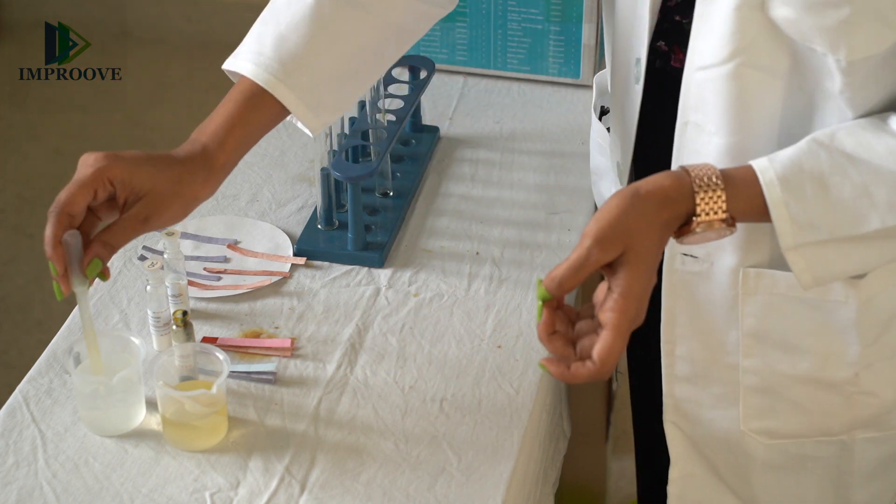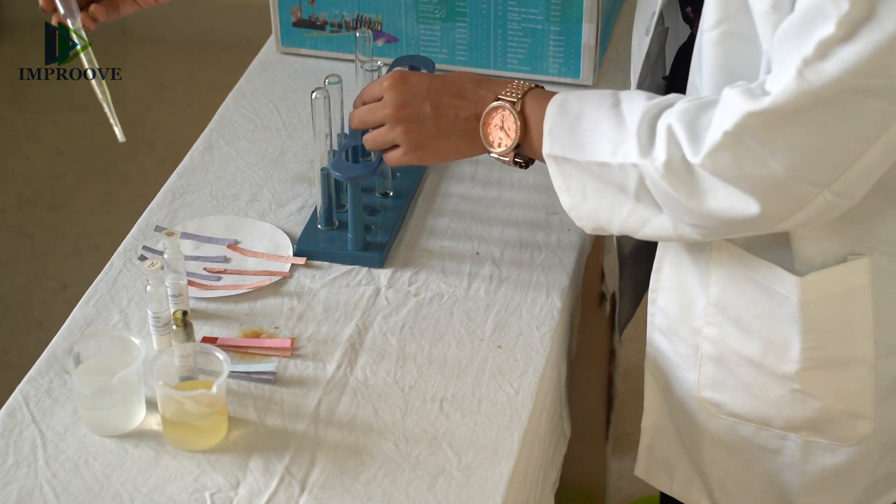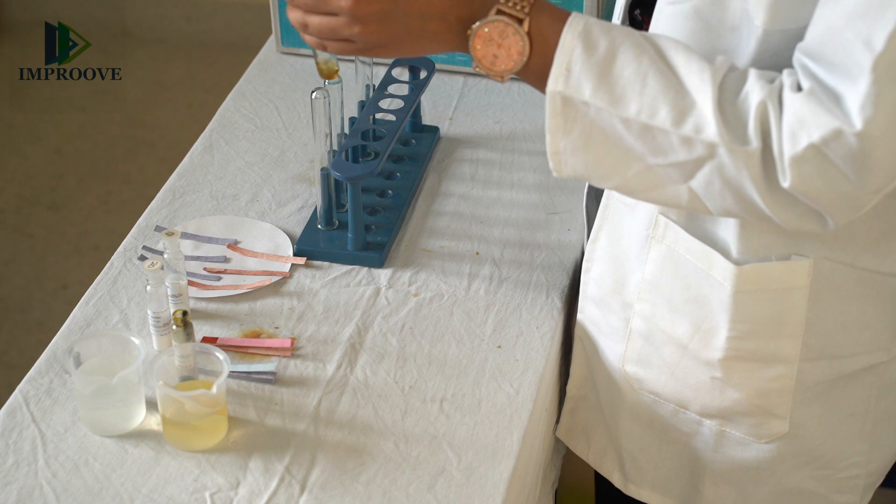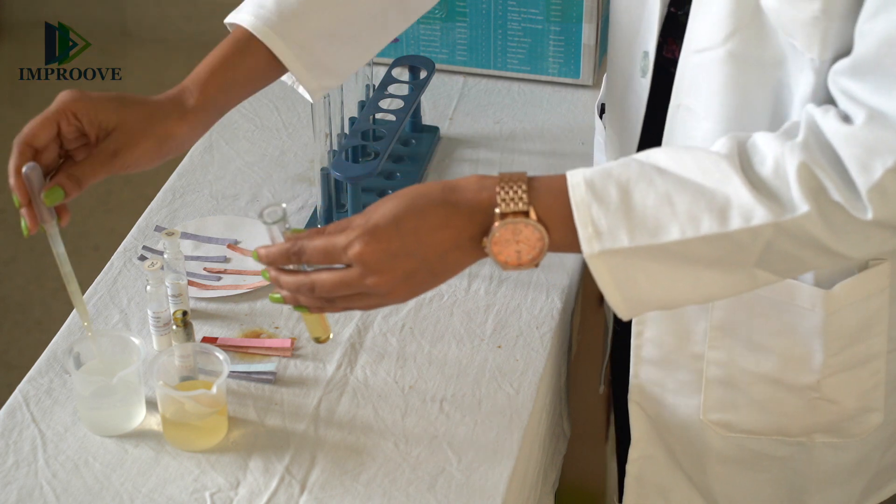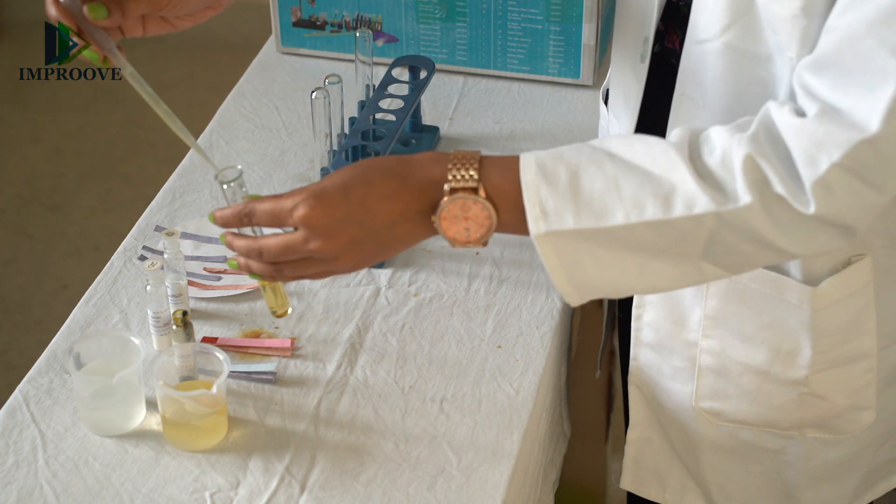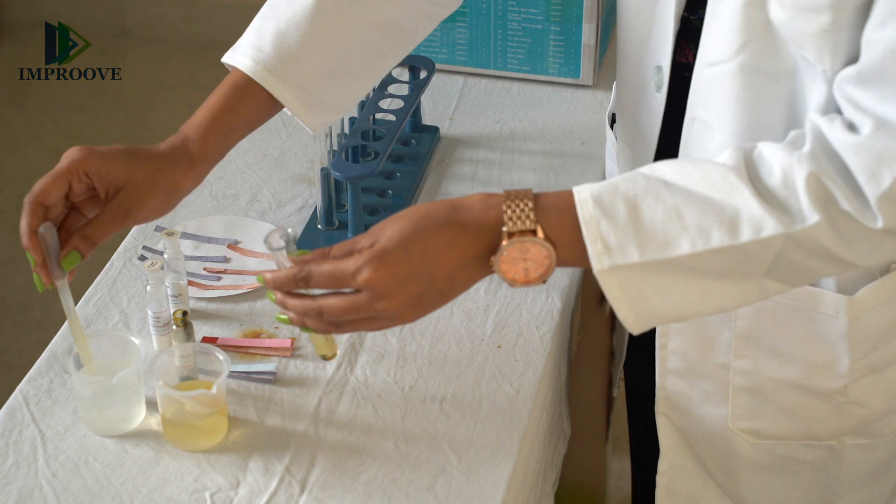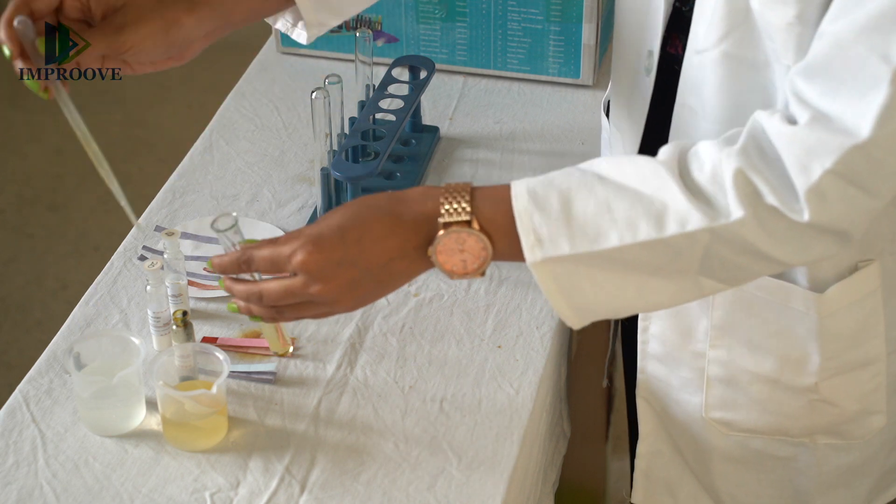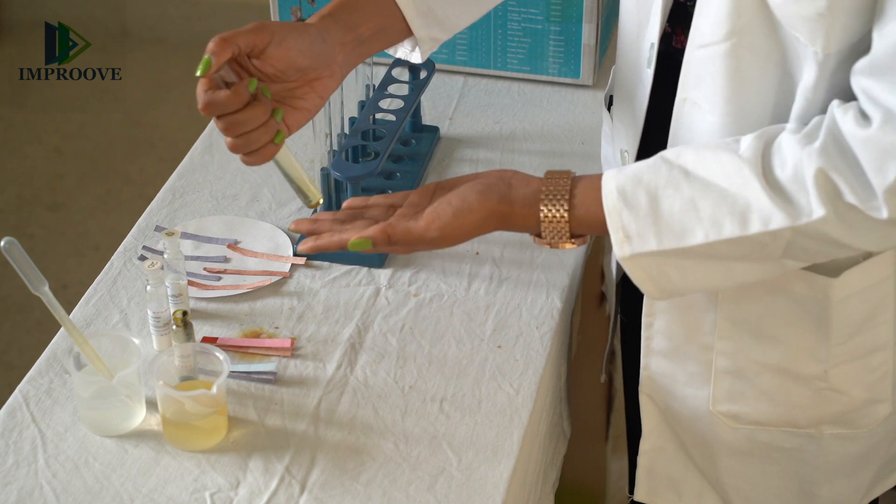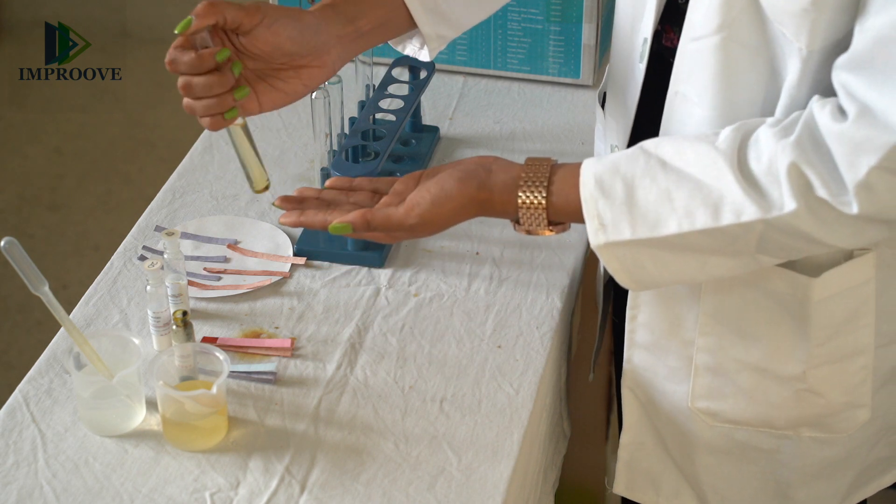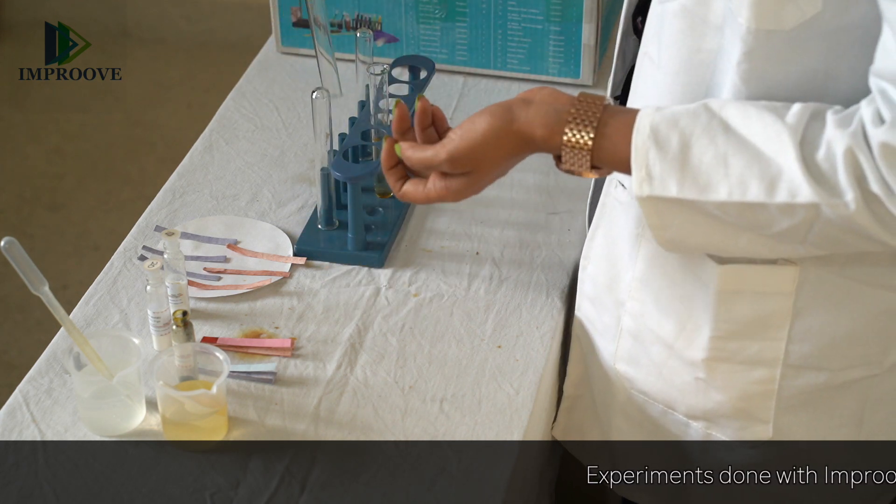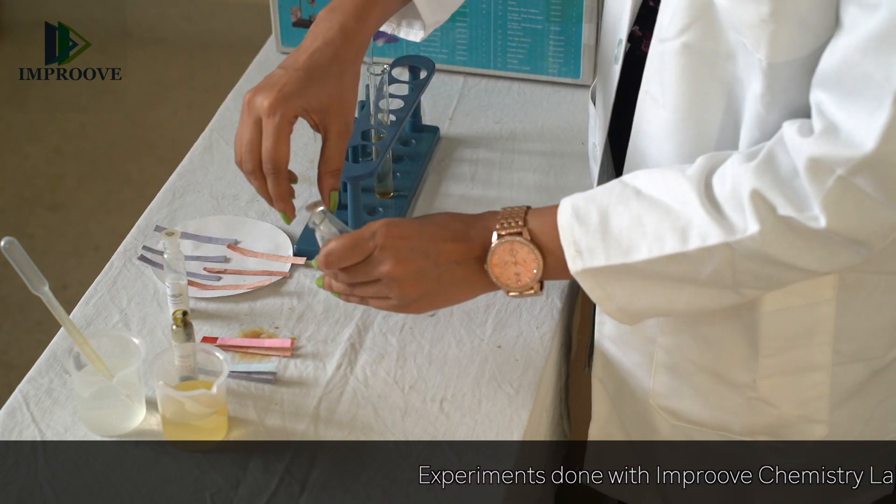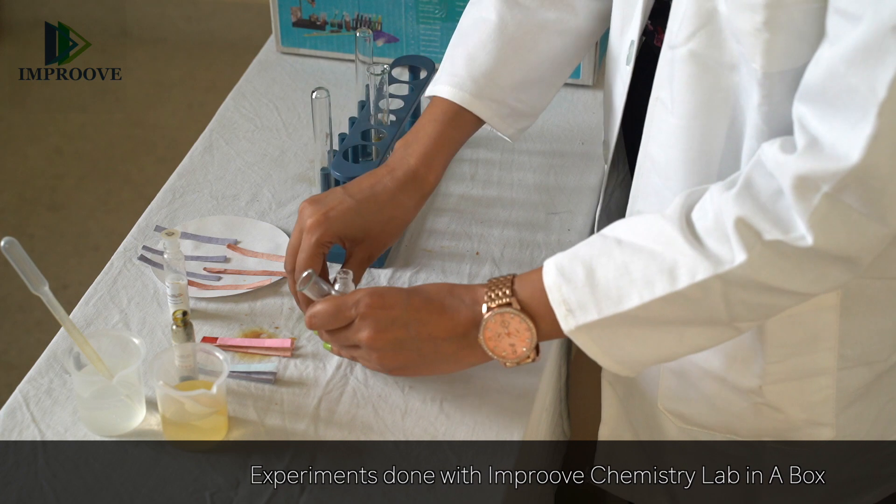Take the dropper and add about 10 ml of water to the test tube. The dropper holds about 3 ml, so you can take 4 rounds of the dropper. Shake the test tube well so that the salt and water mix together, then leave it to rest. Repeat the same process for sodium acetate and sodium chloride to prepare their solutions.